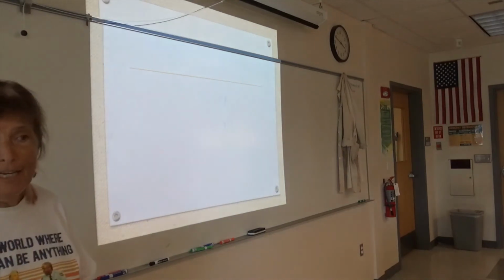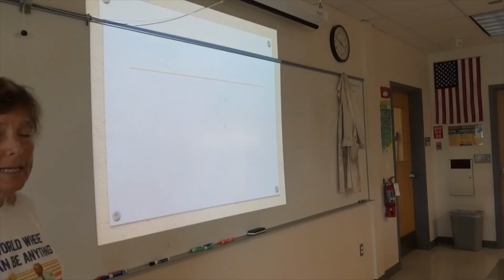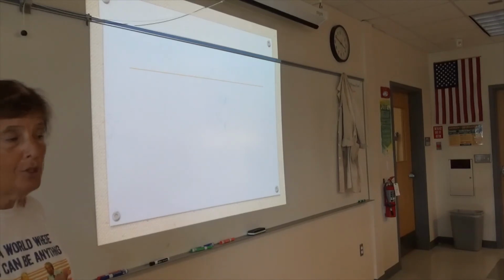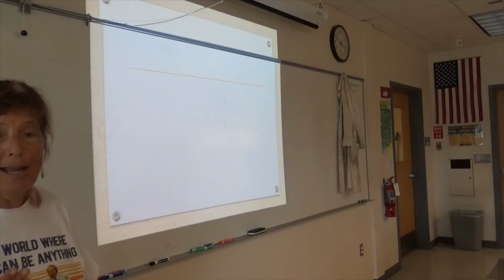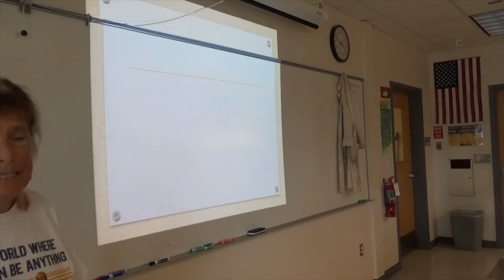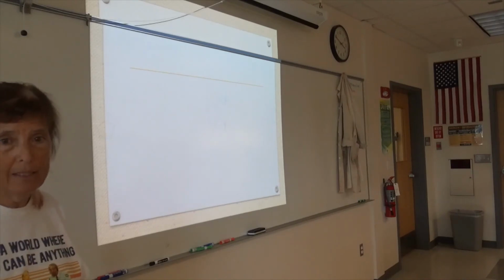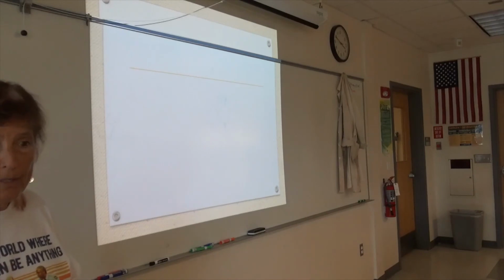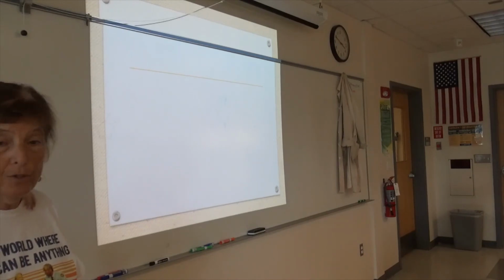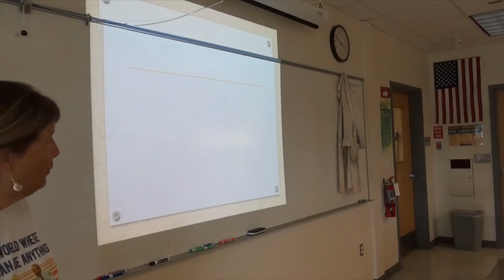Once you have that done, get a mass on it, get an IR on your product, get it appropriately labeled with a blue label, turn it in the blue basket. Please, please, please make sure and label it with what is in it. It is not Friedel-Crafts. That's what you did to it. I need to know exactly what the product or products are. Some of these have 2 different products. You need the name of both of them on the label.